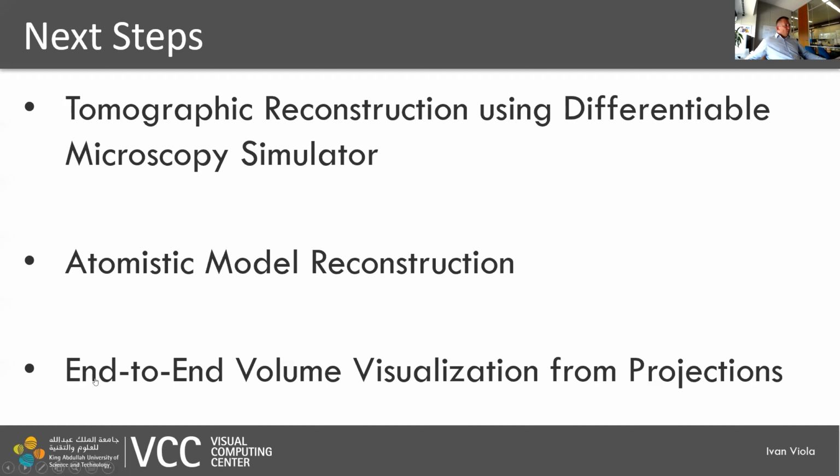What is to come afterwards is that we have shown that this differentiable microscopy simulator approach can estimate the parameters of the detector, or perhaps help us denoise the projections. However, if we go even further, we can use this approach for creating the tomographic reconstruction.